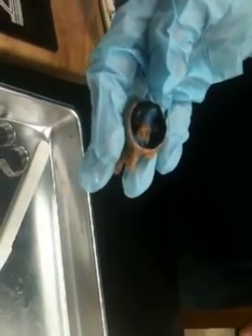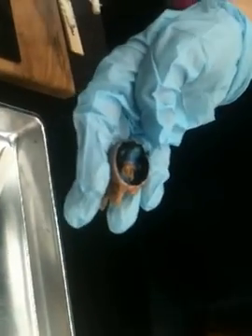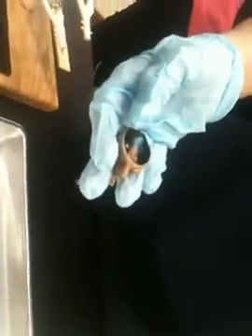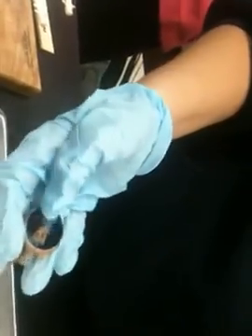Wait, so is the retina the optic cord? You're saying the optic? What? I don't understand. Where they exit out, that's the disc spot. But what is it? What's exiting out? The optic nerve comes out of the eye there, right? So the photoreceptors that are processing that information are sending that to the optic nerve, which connects the eye to the brain. The optic nerve exits the eye and then travels up and connects to the brain, remember? So that's just where it's exiting.